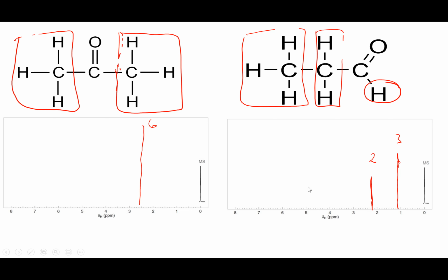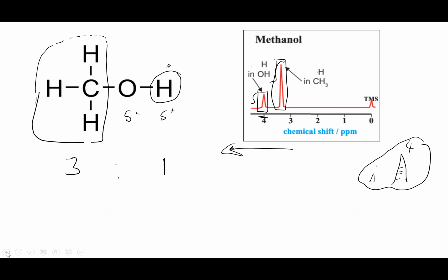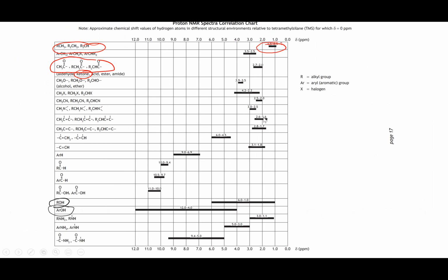Where we're going to see a big difference is in the last hydrogen, because if I go back to page 17, then I'm going to find it a way down. I've lost what, oh, there it is there, okay. So there is the hydrogen that's part of the aldehyde functional group, and you can see that for reasons you don't really need to go into, that's massively de-shielded, and that's going to lie a way up about 9.